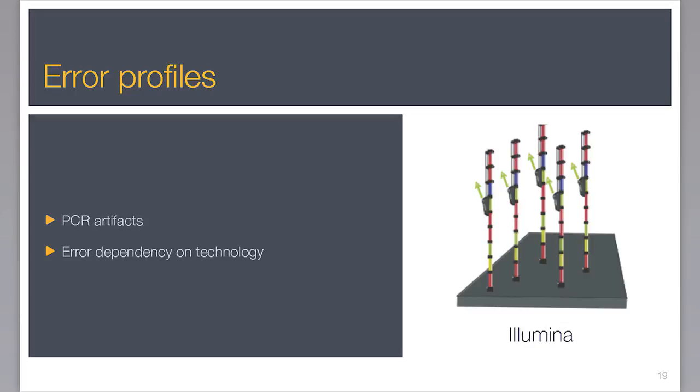It's again very, very dependent on which technology you're using, whether you're using a single cell technology or a nanopore, or whether you're using something like Illumina. But all of those technologies have certain, sometimes random errors, sometimes systematic errors that confound your analysis. For the sake of argument, let's stick to the Illumina sequencing.